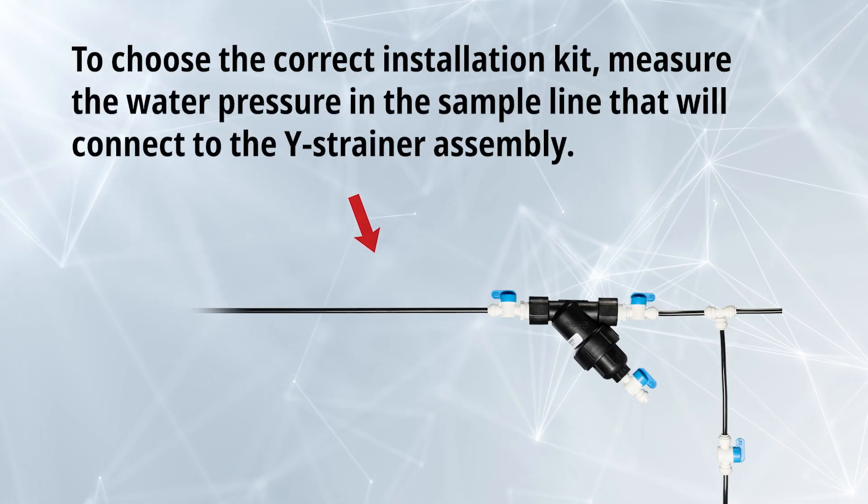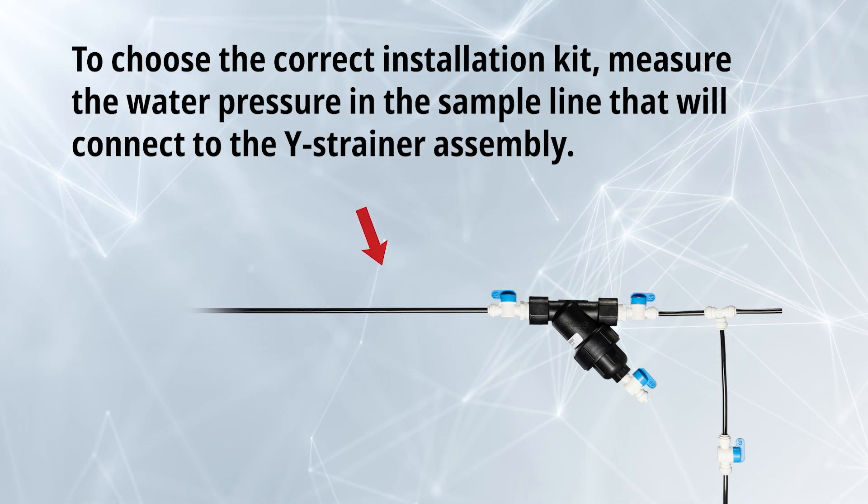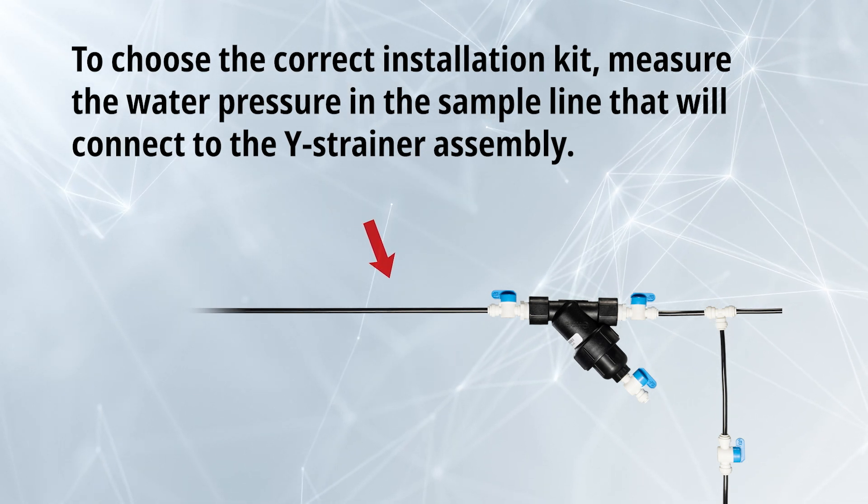To choose the correct installation kit, measure the water pressure in the sample line that will connect to the Y-strainer assembly.